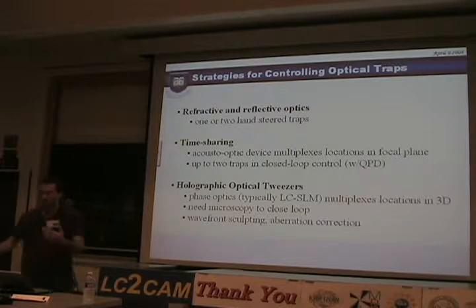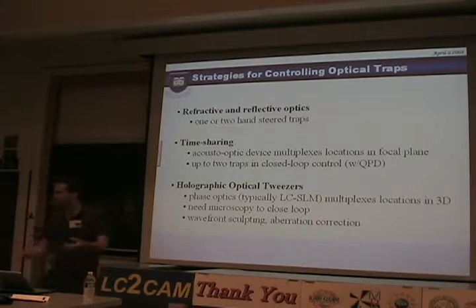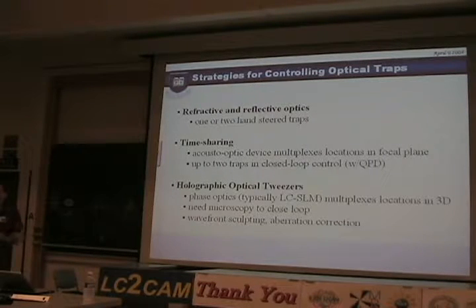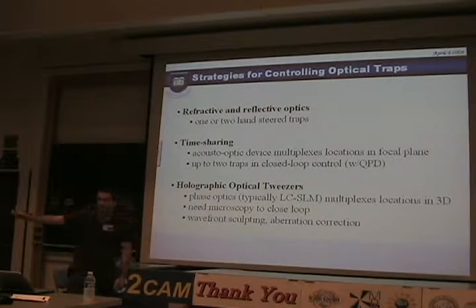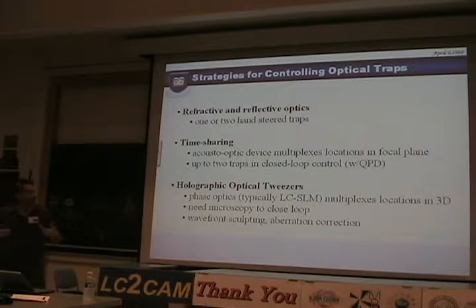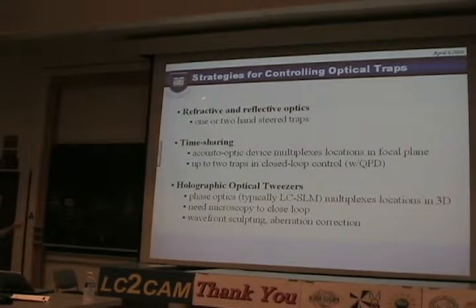And there are a bunch of different choices. The simplest thing you can do is, like I said, you just take a single laser and you focus it with a microscope objective. And when you have that sort of setup, you usually use some mirrors and some lenses, and you get inside of the microscope, and if you want to move things around, you usually tilt the mirror by hand, and you can move particles and beams of light around. That's great for many applications. It's especially good for undergraduate teaching labs, and lots of universities have this sort of setup in an undergraduate teaching lab nowadays.